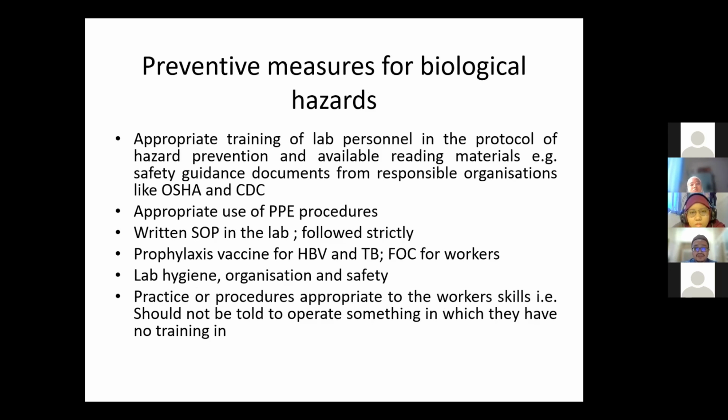Preventive measures for biological hazards are basically the same things that I have mentioned. We must use proper PPE, undergo appropriate training, know the SOPs, and have access to reading materials like safety guidance documents. SOPs must be there in the lab, on the wall, and must be followed strictly.